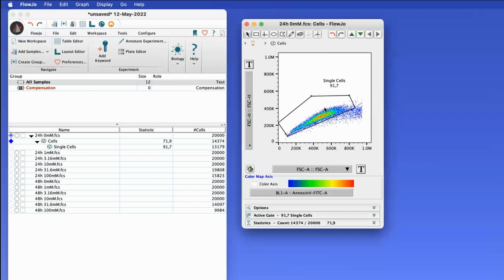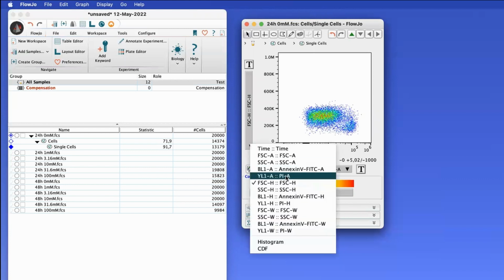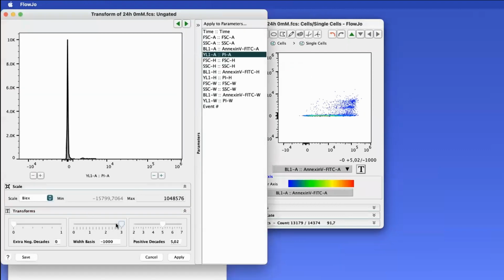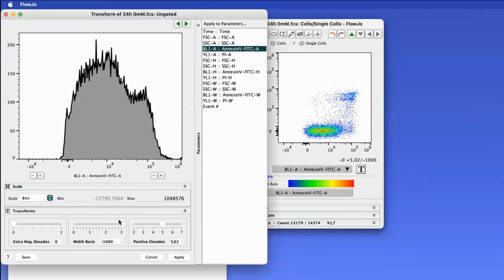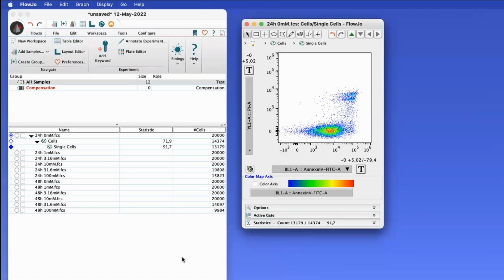And then go into our Annexin PI stain. So in this case, I had Annexin V and normal PI. Ooh, axes look a little crazy. Let's adjust that a little bit. And get around a little bit of space on this one. I liked it better that way.